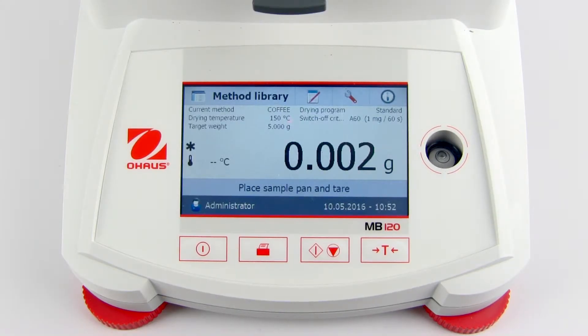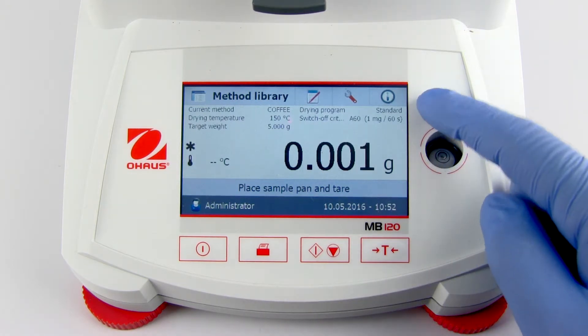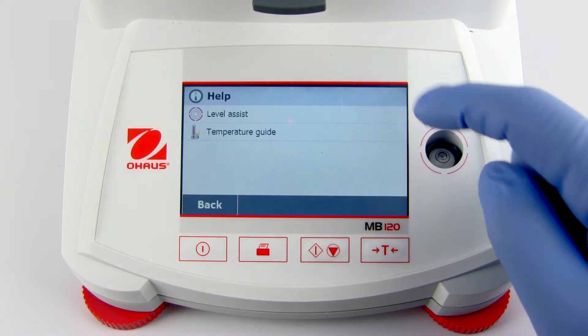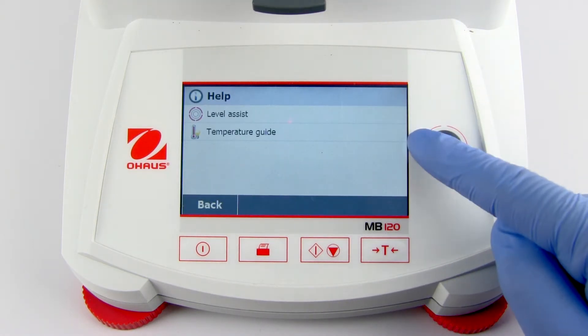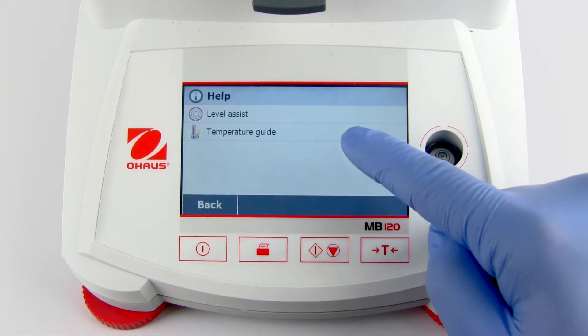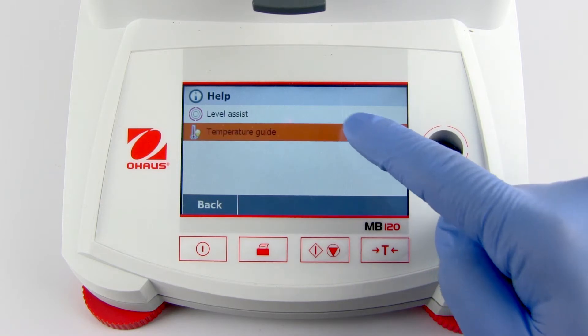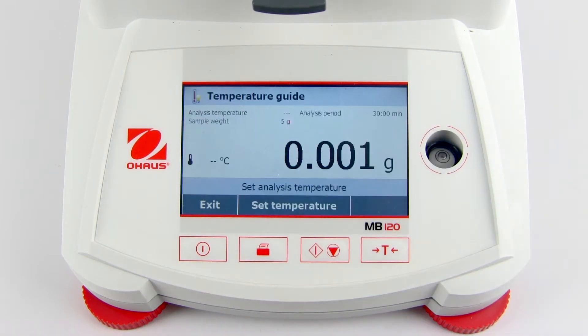To access the temperature guide, press the Help button in the upper right-hand corner of the home screen and select Temperature Guide. Follow the instructions on the screen.